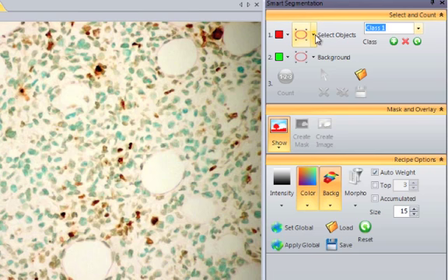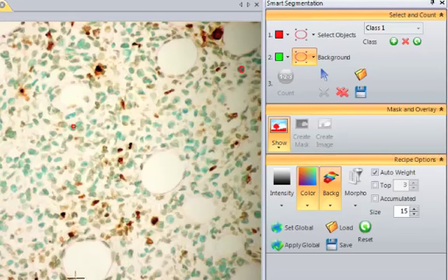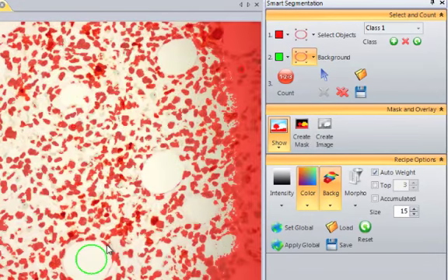For this, maybe the easiest thing is actually to just click and drag on the image, right, and it selects everything that's going to be the same shade of blue. Right, select a few just so I've got some representative samples, and then what I'm going to do next is I'm going to select a background. So if I click the background region here and click and drag on the image, same as I did with the object selection, as soon as I do that, you see it's going to have two different types of objects.